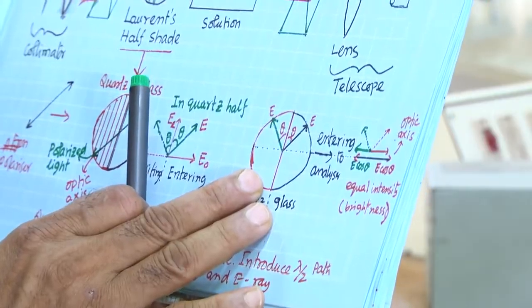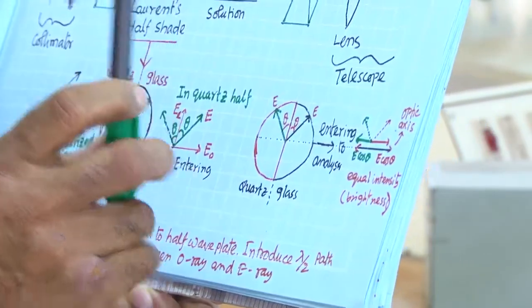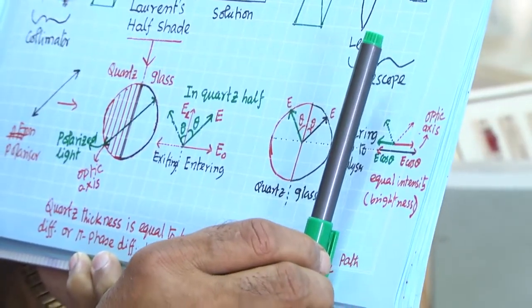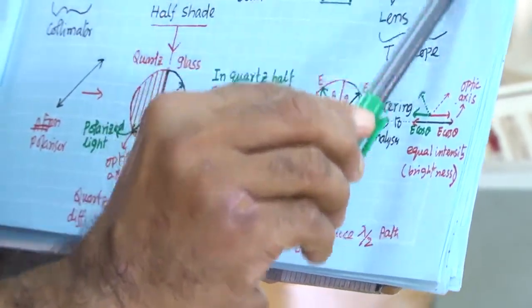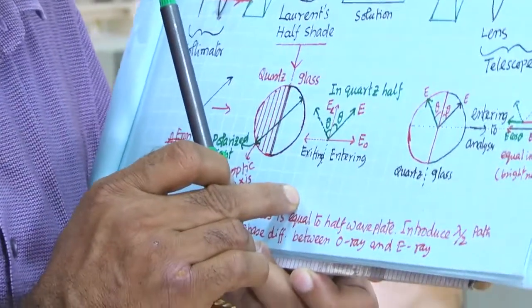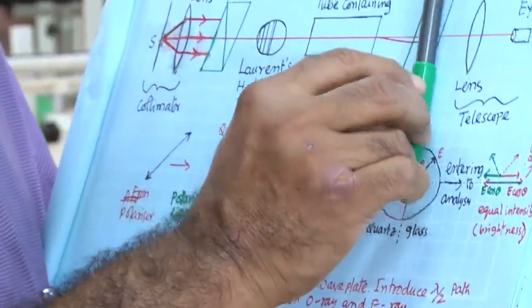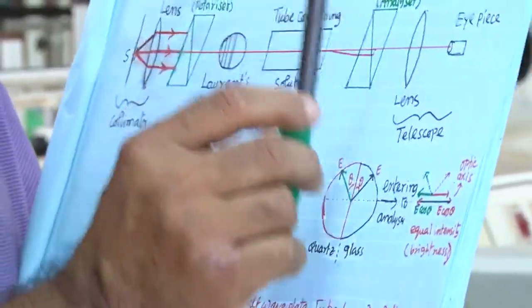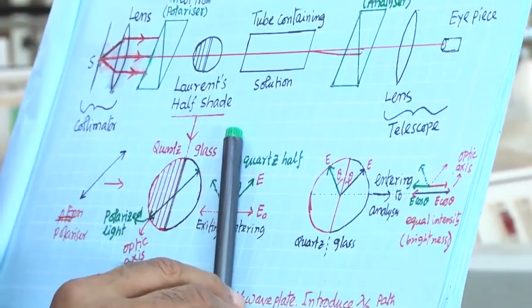If we take that as the standard, always we will do this 360 degree rotation, then we will take 4 readings. Wherever we get this uniform situation, we get these 4. For water, we will note down the readings.